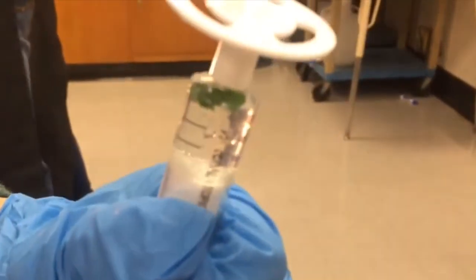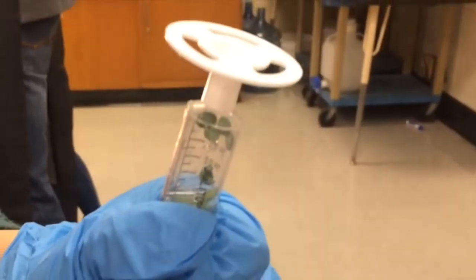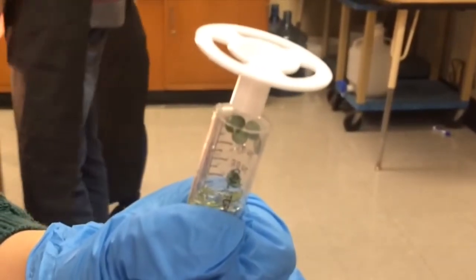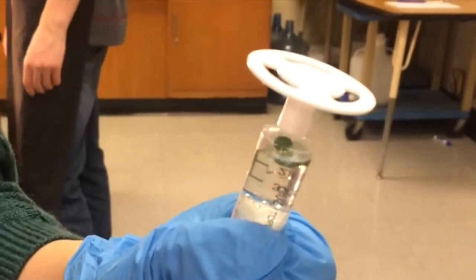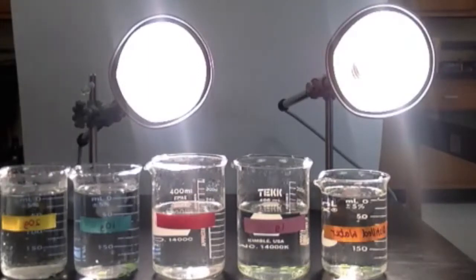Before conducting the experiment, we first removed gas from the leaves. This is a necessary procedure in order to get the leaves to sink initially, then to measure the rate of photosynthesis as they rise with the production of oxygen. What you see currently on the screen was our actual experimental setup.